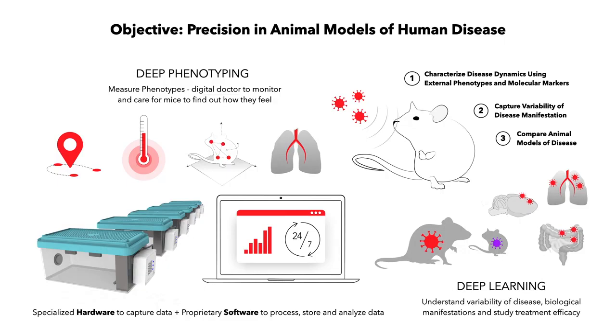Importantly, such high-throughput data acquisition from animal experiments often fails due to instrument complexity and high costs, resulting in short-term observation studies with limited sensitivity to account for long-term trends in animal condition and physiology without significant invasiveness. That's why the system that we built is a balance between ease of use, cost effectiveness, scalability, and long-term monitoring capabilities.